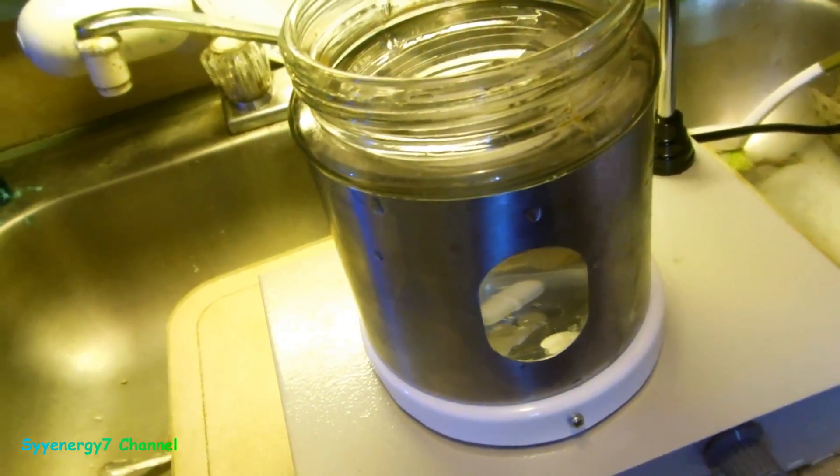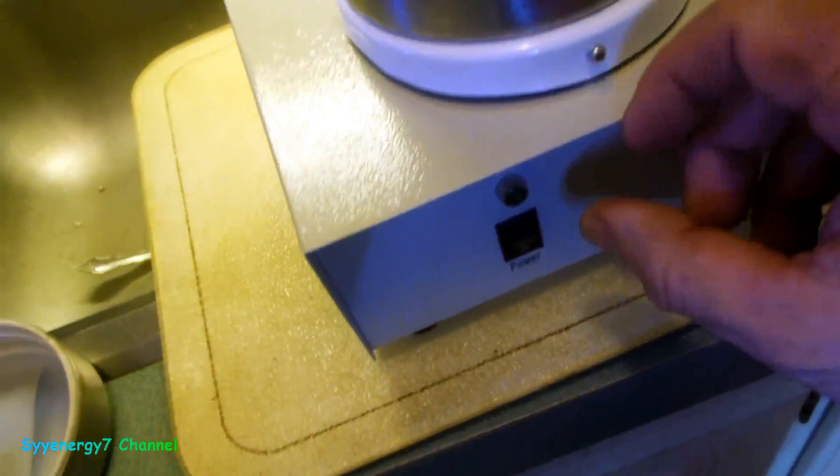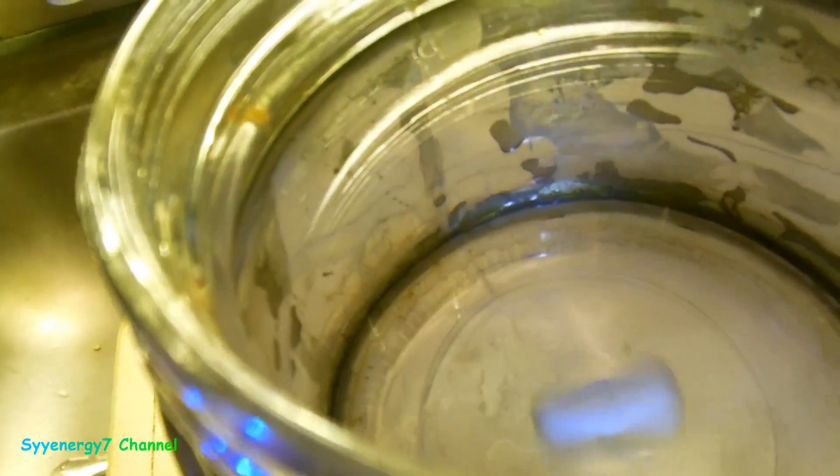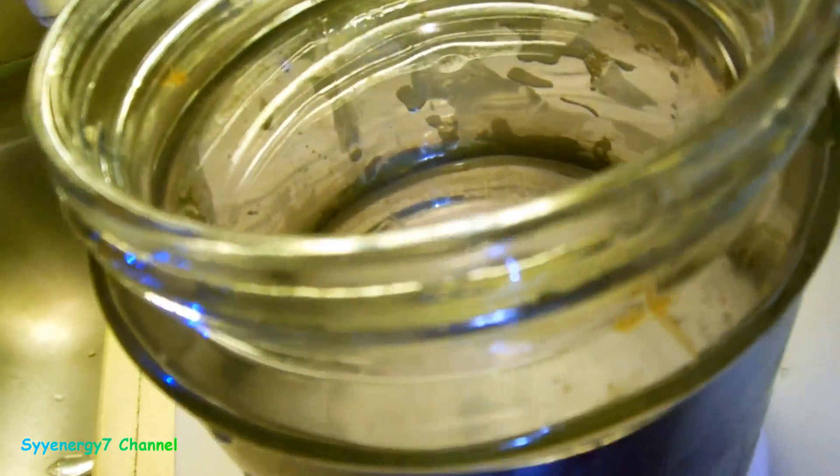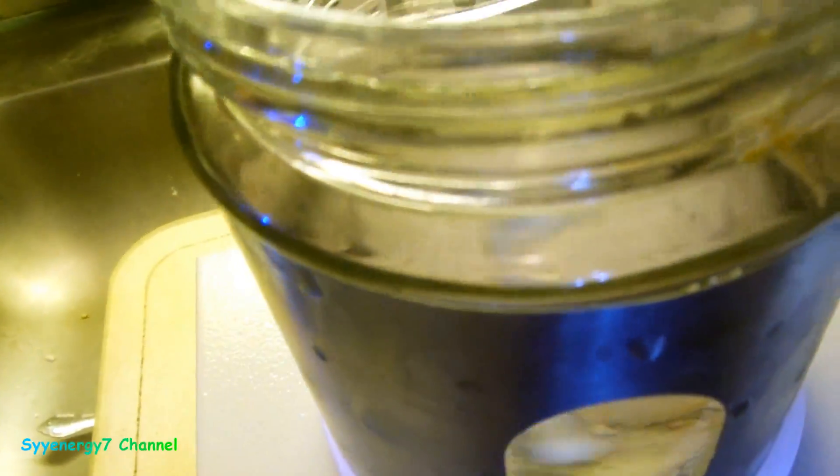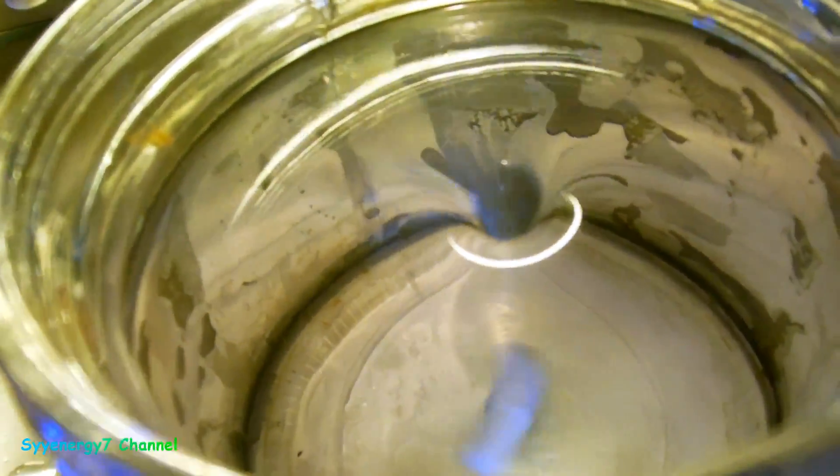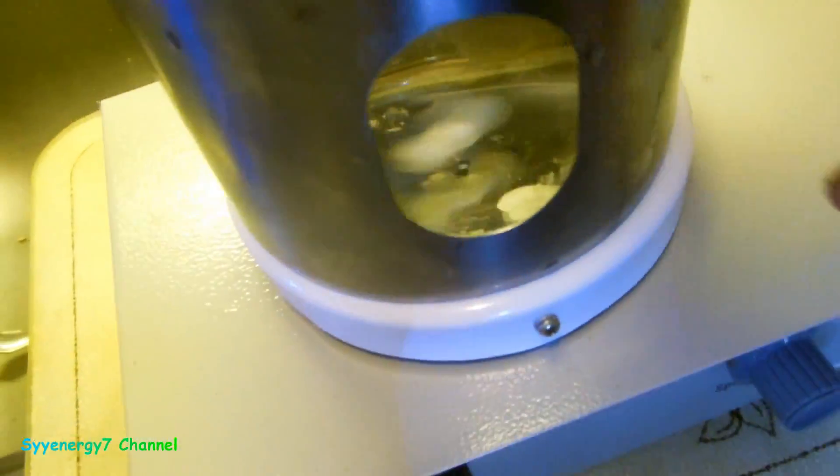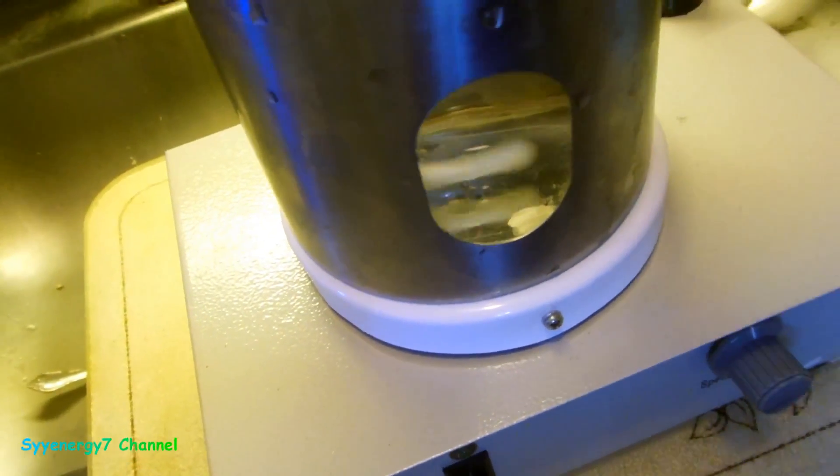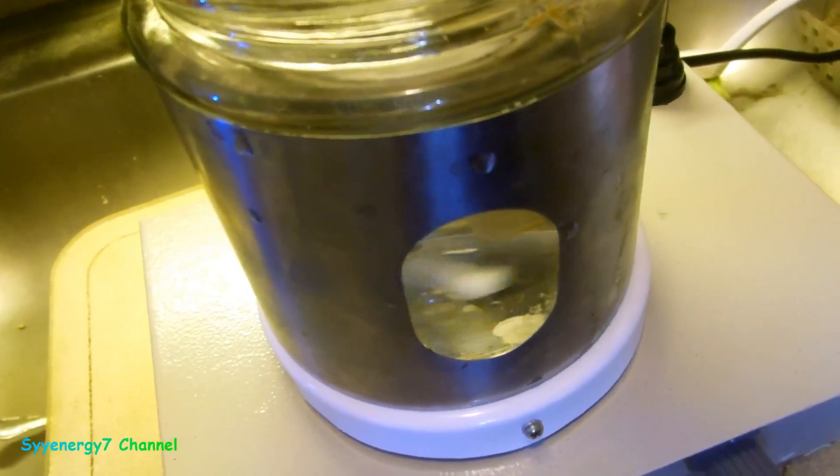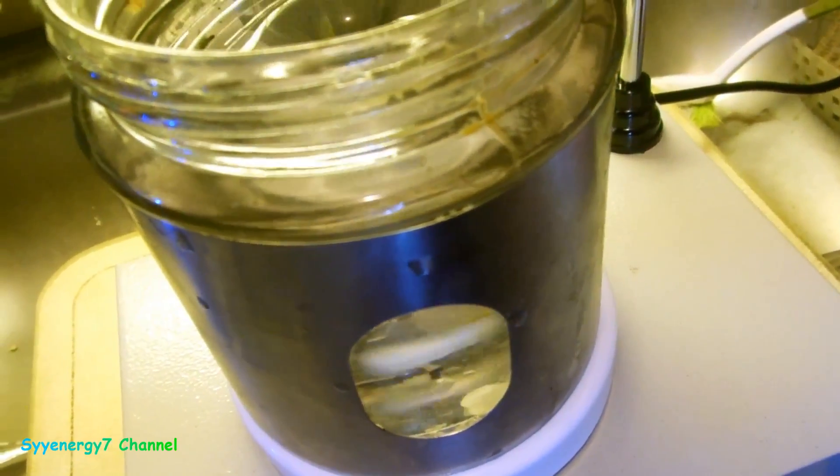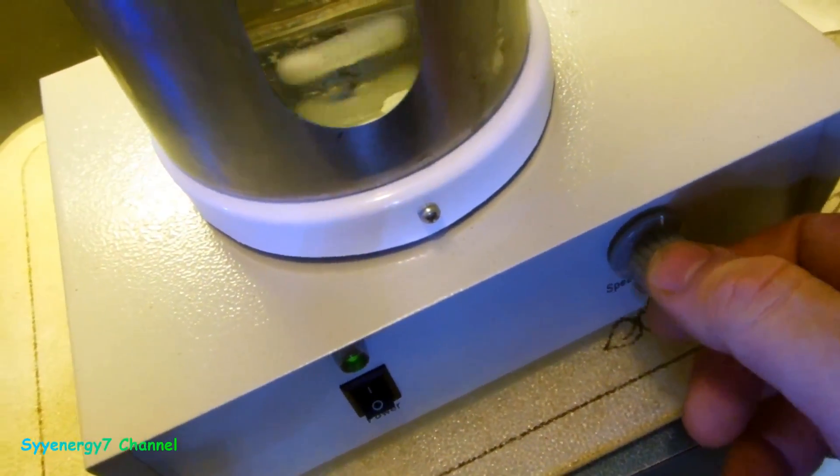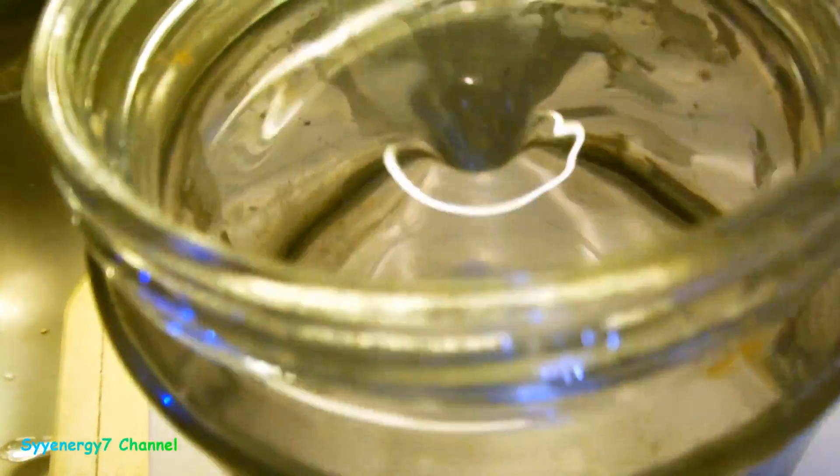And it's glass, it's strong, it's steel. So here you turn this on, watch. See that? What it's got inside there is a little oblong Teflon coated thing that the magnet picks up on this plate, and nothing touches anything. It's Teflon coated. Teflon is actually a material that's inert to any type of chemicals up to about 500 degrees. And it's got a speed adjustment, so you can go like this. See, see that swirl?